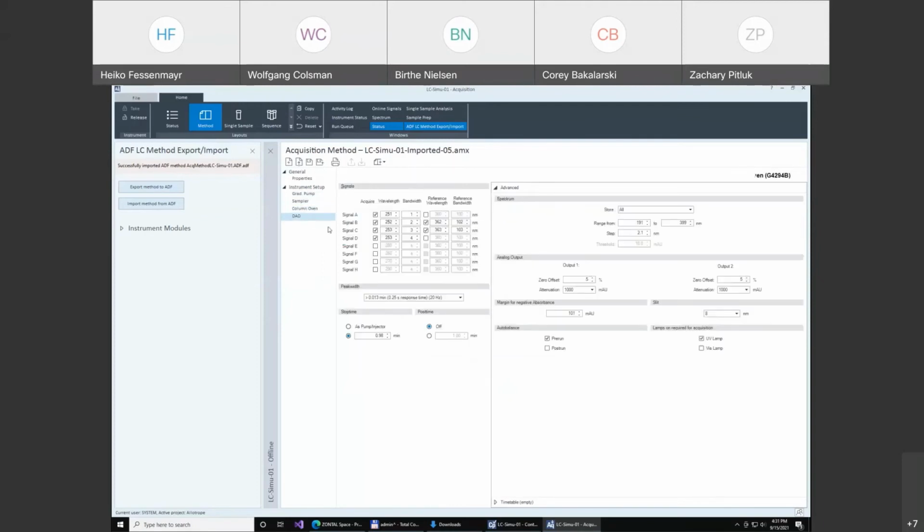So this is the one where you can see the methods for the base length parameters. So that shows that the things have been imported correctly. And this is the workflow of the export import. And that's what I wanted to show you today.